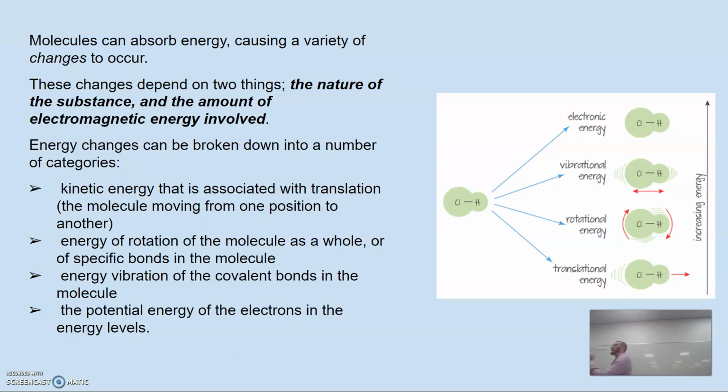So what happens is that bonds, covalent bonds is what we're looking at, interact in different ways with different parts of the electromagnetic spectrum. Okay, so NMR is radio waves. IR is obviously infrared. UV vis spectroscopy is obviously in the UV and the visible, right? X-ray crystallography is obviously in the X-ray region, and so forth, right?